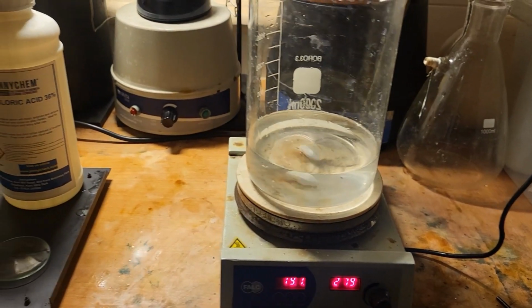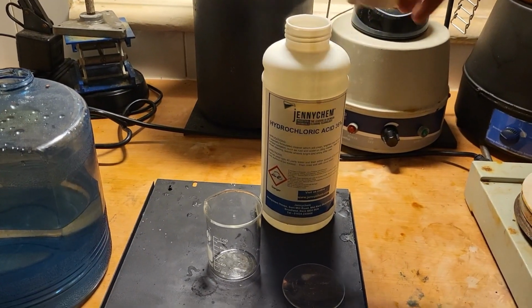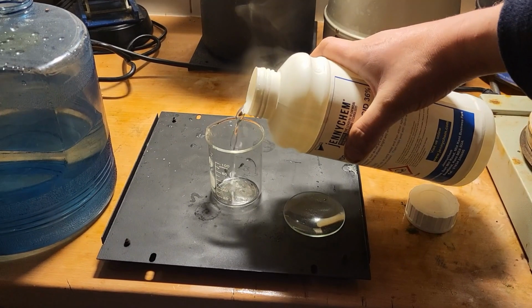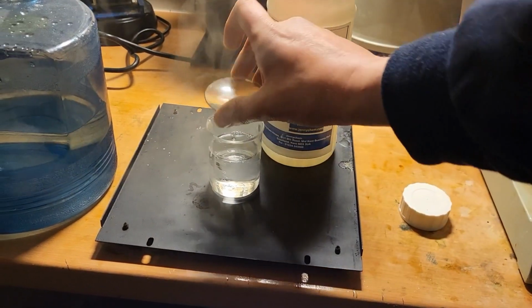Next, we want 100 mils of hydrochloric acid, 36%. Pour this into a beaker and cover with a watch glass.